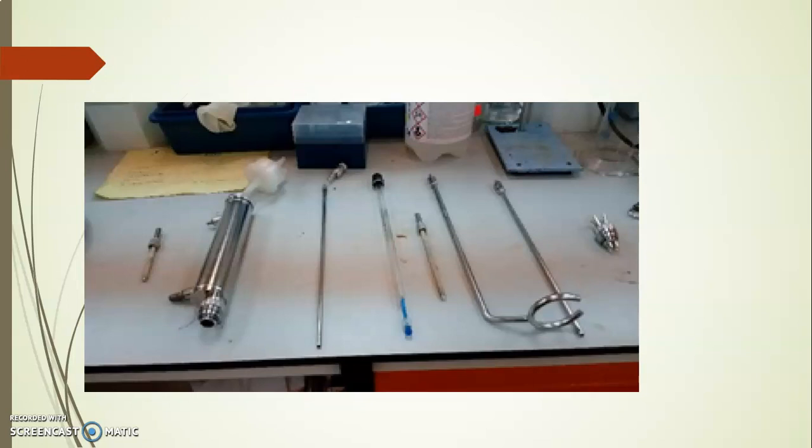Number two from the left is the condenser, number three is the sample collection port or pipe. Next one is the pH probe. This is the pH probe. Already I have told that this is the antifoam probe. This is the sparger. This is the extra port, which can be used for different purposes such as culture inoculation. This is the four-way probe. This is very necessary, and can be used for acid-base dosing to control the pH.